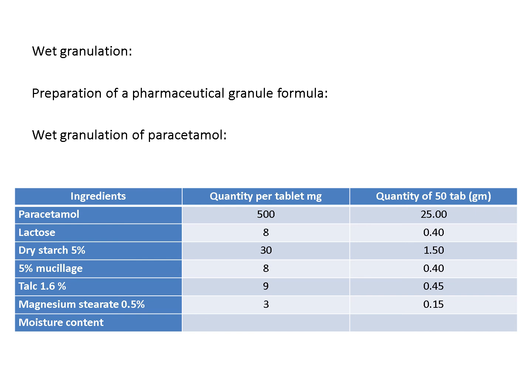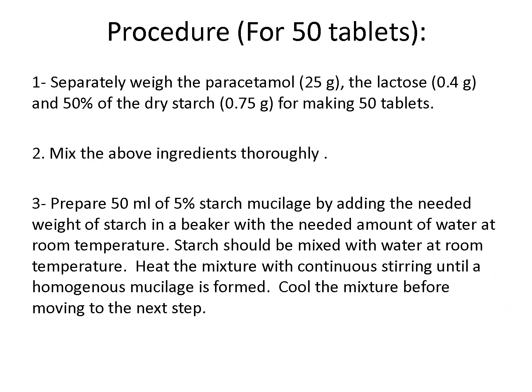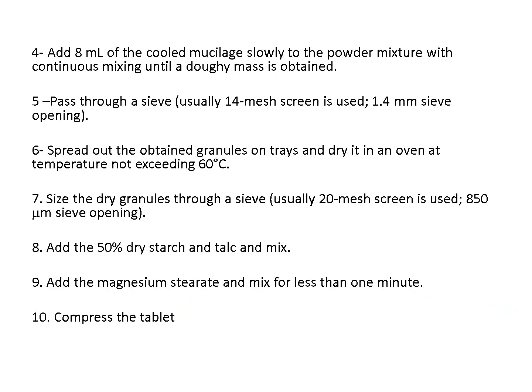Then we compress our tablets and form 600 milligrams as the weight of each tablet. Eventually we will get fewer than 50 tablets because we are working on a small scale by hand. The percentage of loss here is very high. Okay, I finished this experiment.